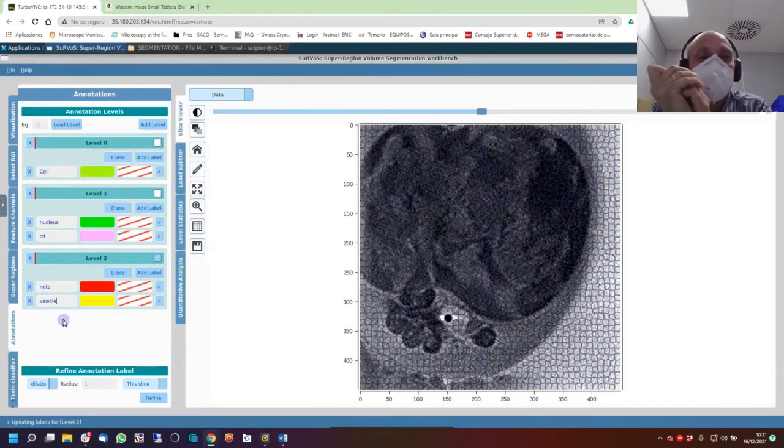No, it will be in the name. In fact, you will see it later. All the structure that we have here, level 0, will have a label 0. Level 1 will have a label 0 and 1. Level 2 will have label 0 and 1, and the name of the label will keep this structure. So that's the way it works.